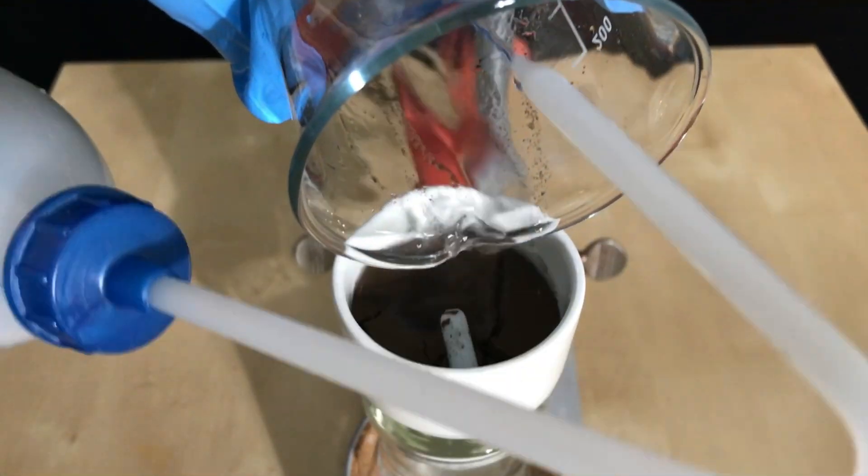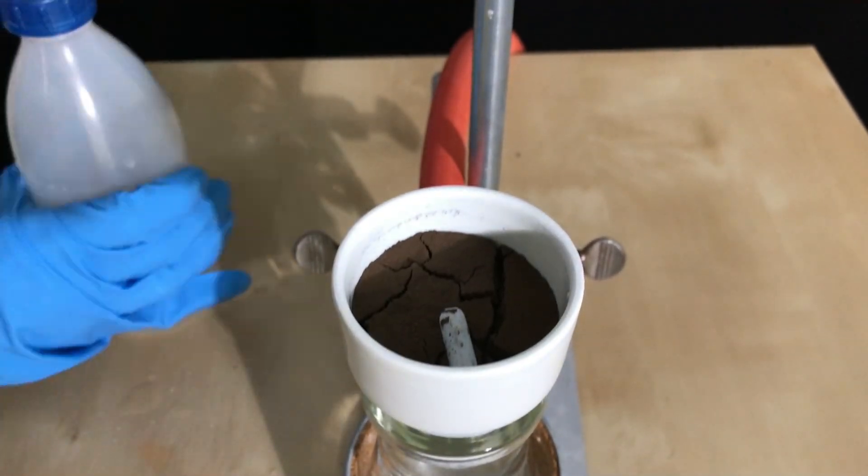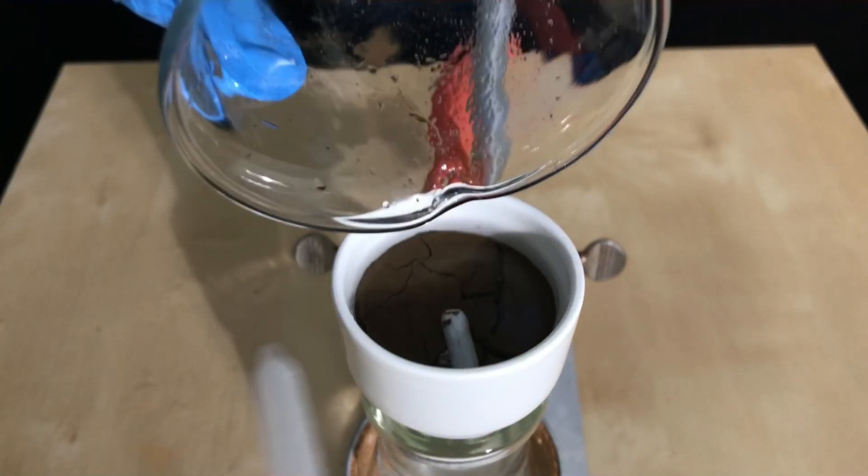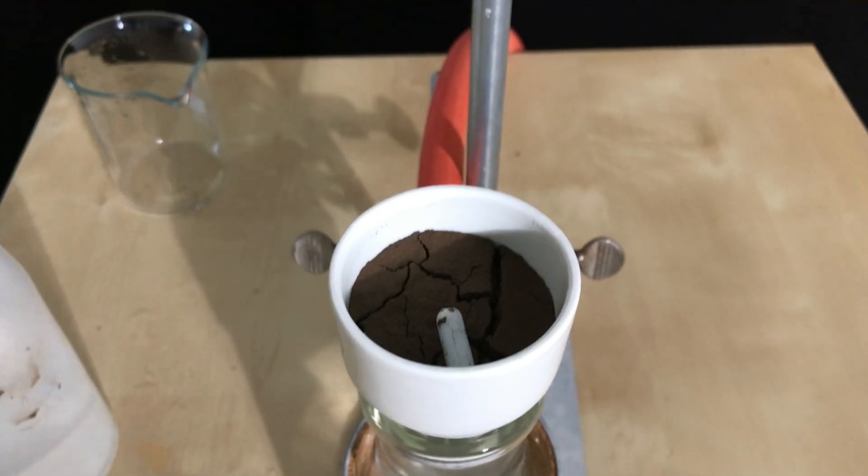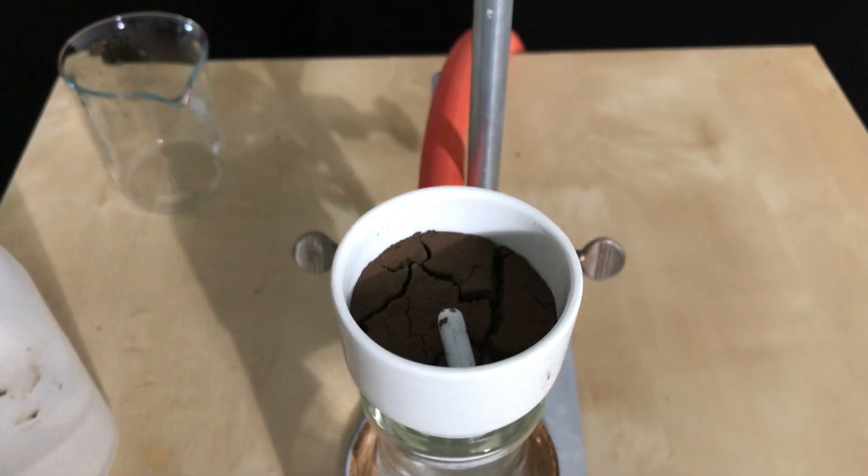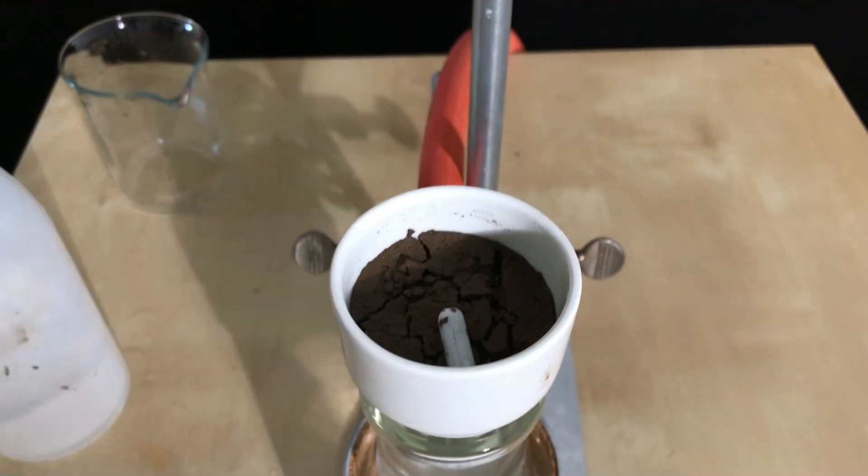Afterwards, the silver oxide suspension was simply put into the filter. Before shutting off the vacuum, even more distilled water was used to rinse the silver oxide. Afterwards, the vacuum was pulled for 2 more minutes to get rid of as much of the water as possible.